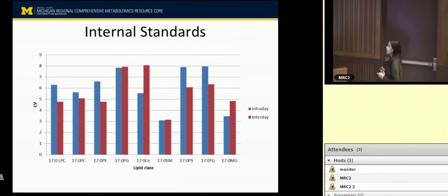So I'm going to briefly tell the normalization method that we use regularly for lipidomics, but I'm going to talk a little in detail in the hands-on session about this. So for lipidomics, the relative response to internal standard works pretty well if we don't have any other kind of batch effects, just normal relative response to internal standards.